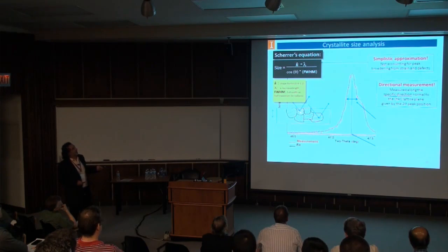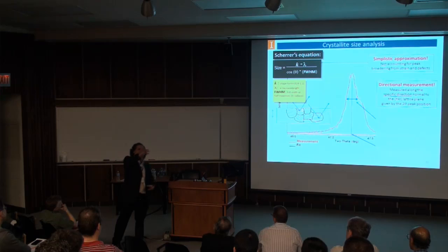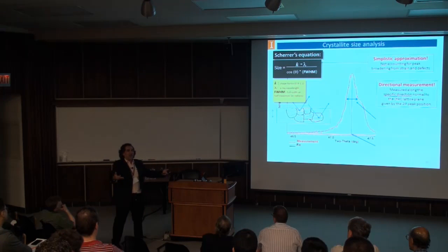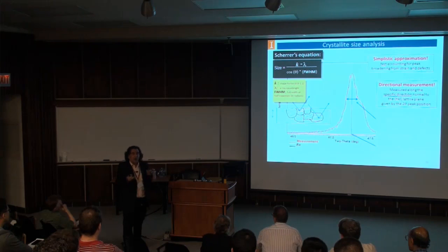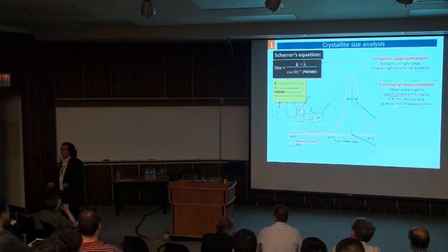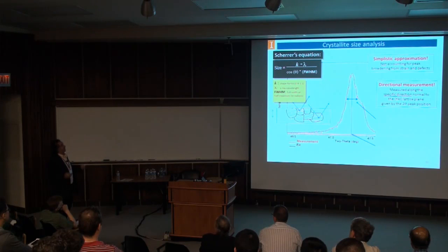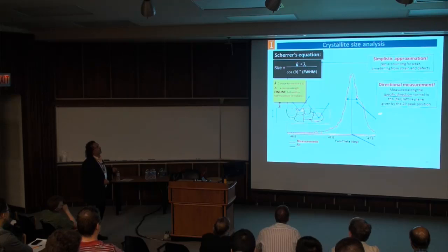Also, it's a very directional measurement. I have seen many people, for example, if you have a sample that's a very long column, if they measure the grain size sideways, it's going to be small. They come to the X-ray and measure the height of that tower. It's going to be long. So they cry, so we are measuring different directions. That's why. So then they get happy. They kiss me, give me a tip maybe, and then go on. Life is better now. But you have to understand that.